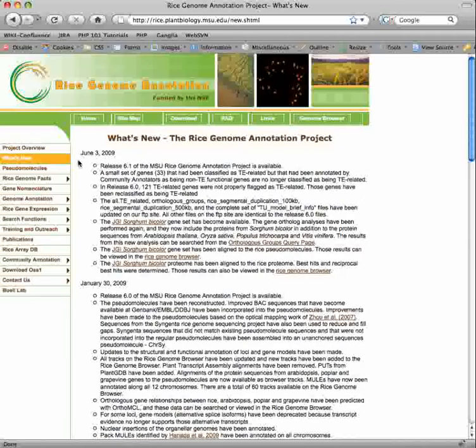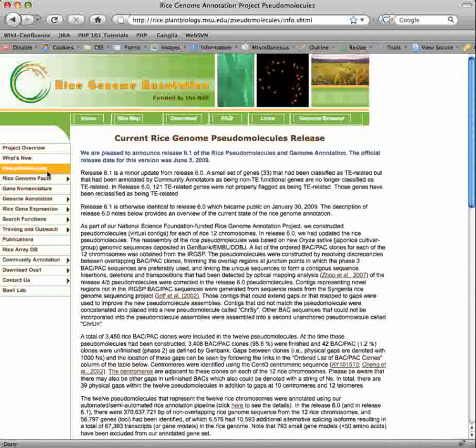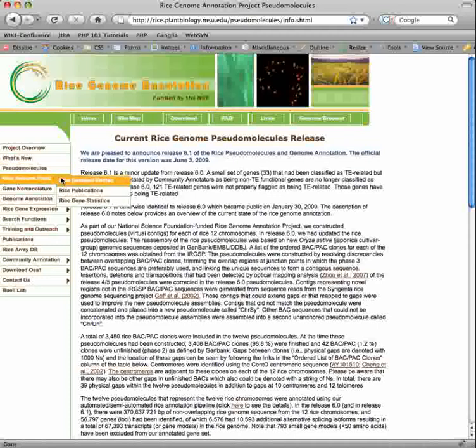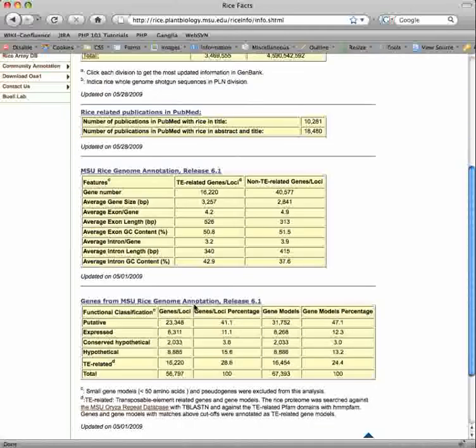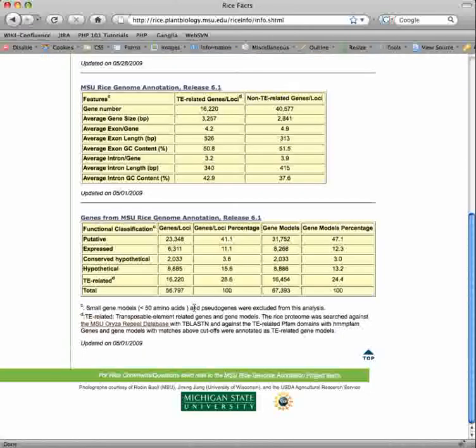The What's New page provides information on our releases and other updates to our database and resource. Details on the construction and annotation of the current release of our pseudomolecules can be found here. Statistics on nucleotides and publications for rice are available in GenBank and PubMed, respectively. Statistics on the MSU Rice Genome Annotation current release are provided at the bottom of the page.